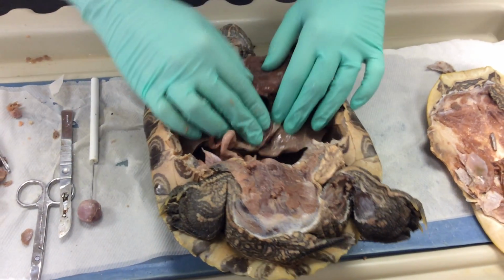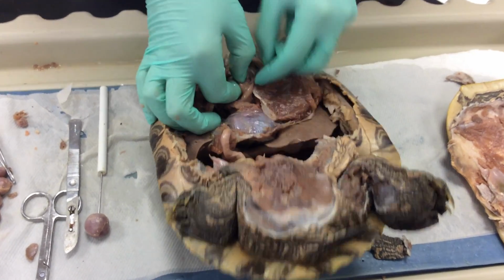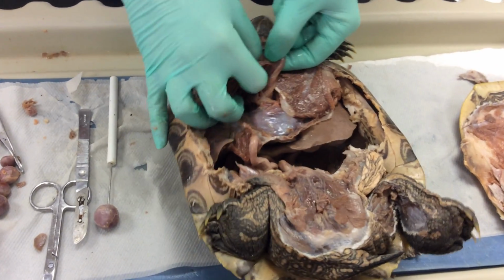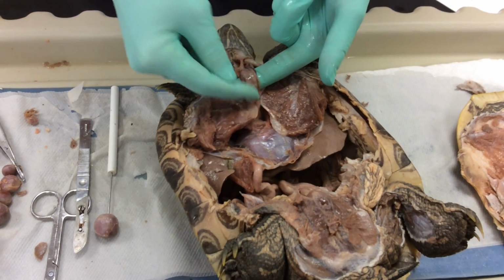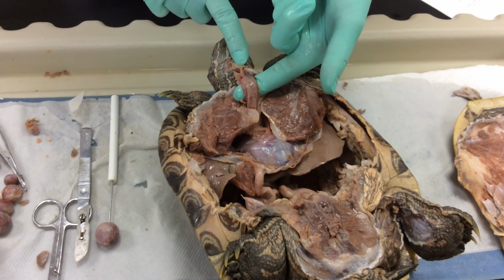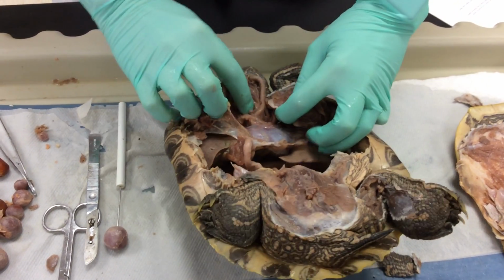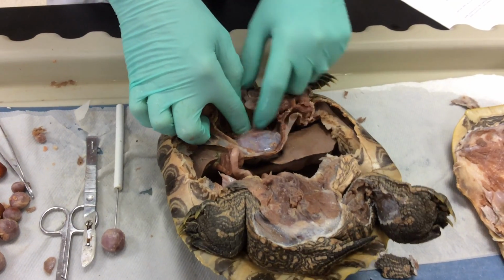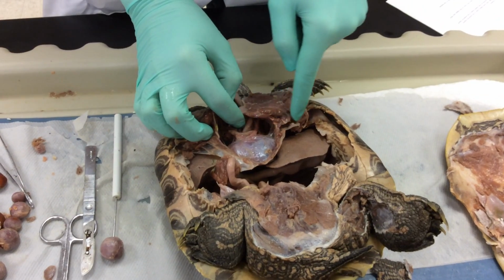All right, so now we're going to look at the digestive system. When we look at the digestive system, we have the mouth, and at the back of the mouth, we saw earlier, you have a tube, and this is the esophagus. Food is going to lead through the mouth into the tube. The tube also goes behind the heart, and that's this structure we'll get to in a second. And it goes this direction.